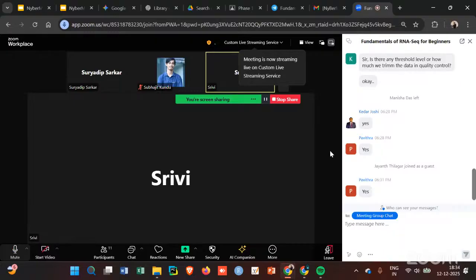All of these things are taken into consideration when you actually think about the experiment. So if you're sequencing DNA with the purpose that I will perform genome assembly, for example, right? Genome assembly is the technique wherein you sequence and figure out the genome. You don't have a genome per se, and you figure out the sequence of the DNA. In that case, you would require a much higher k-mer, because you would require much larger overlapping sequences. Makes sense, right?